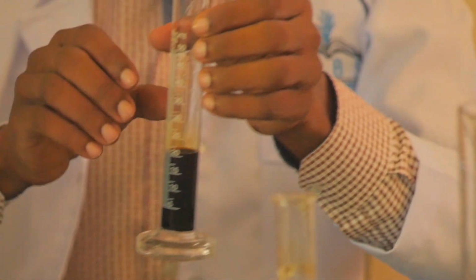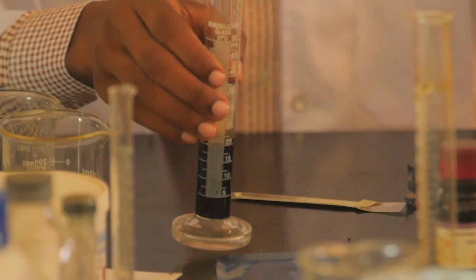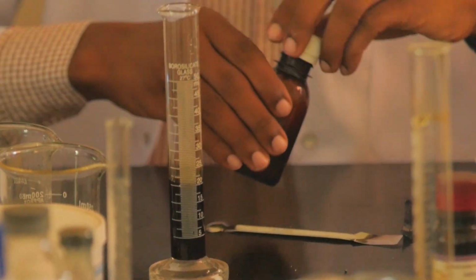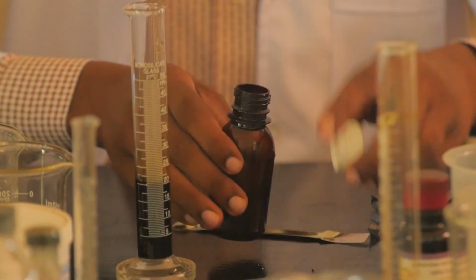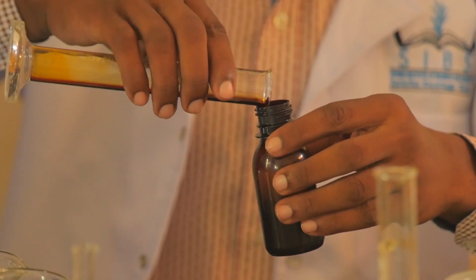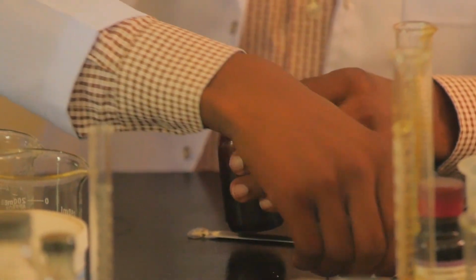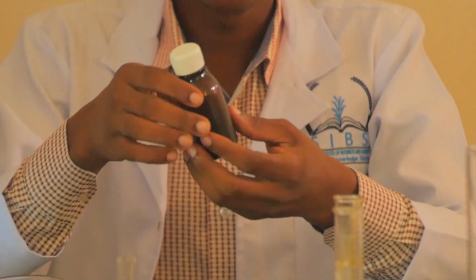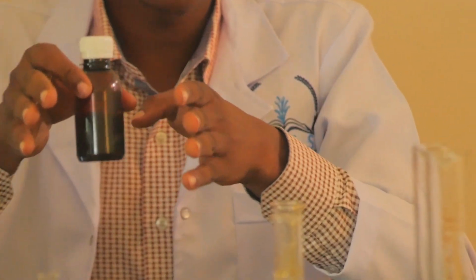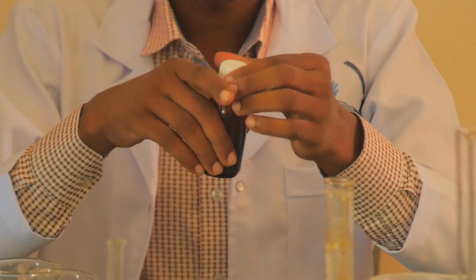Mind you, this is weak iodine solution or iodine tincture. After you are done, pack your preparation in an amber colored bottle, but it should be fluted because this is for external use. Take a fluted amber colored bottle to avoid reaction with light. Then close your bottle and label your drug, then dispense to the patient. So that's how to make weak iodine solution or iodine tincture.